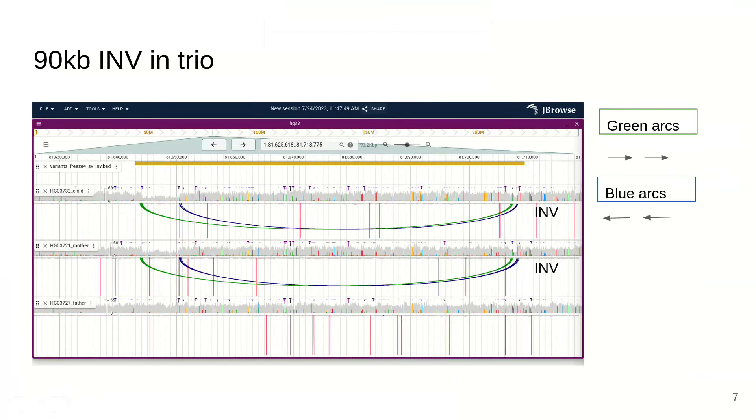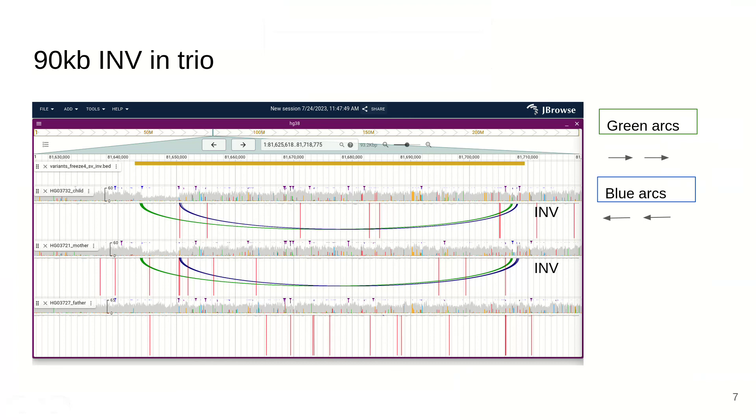We can also view things like inversions using short read paired end reads. If you open up this arc view in JBrowse2, it will color the paired end reads according to whether they're discordant or normally paired. Discordant pairs are pointed in the same direction. Normally paired end reads are pointed at each other. Depending on that orientation, that's green or blue. When you have them overlapping like this, that is a solid indication for an inversion.